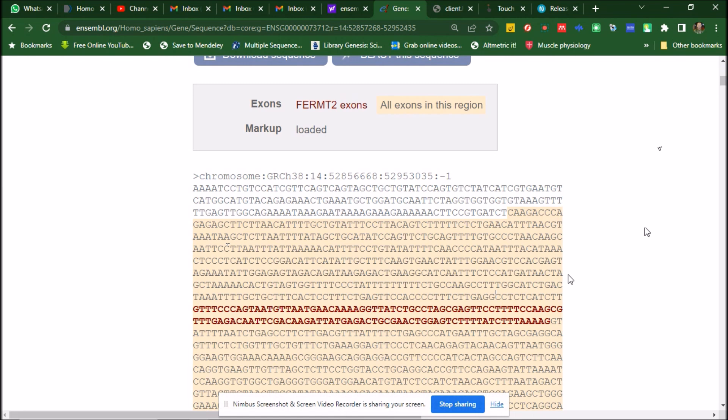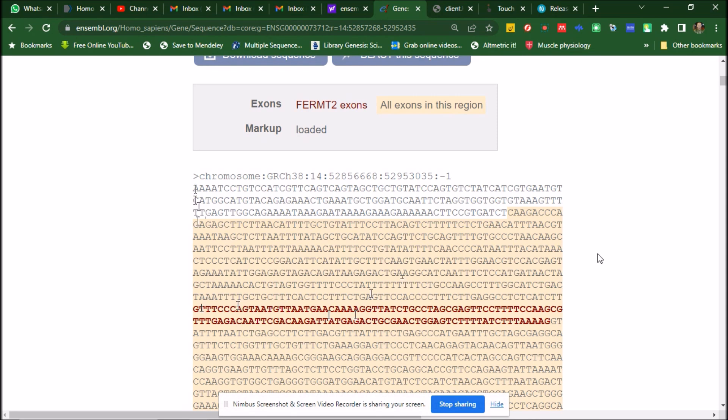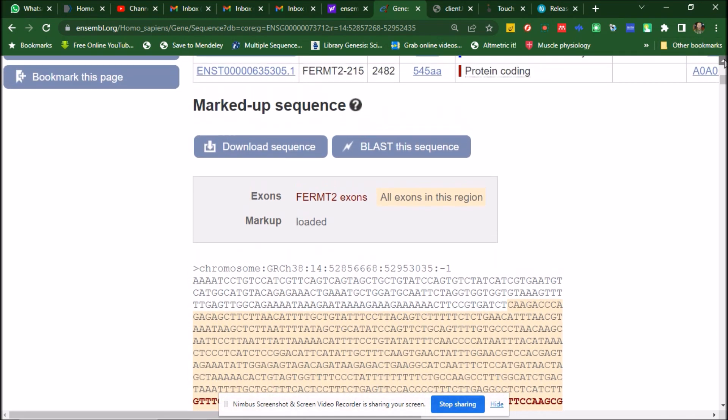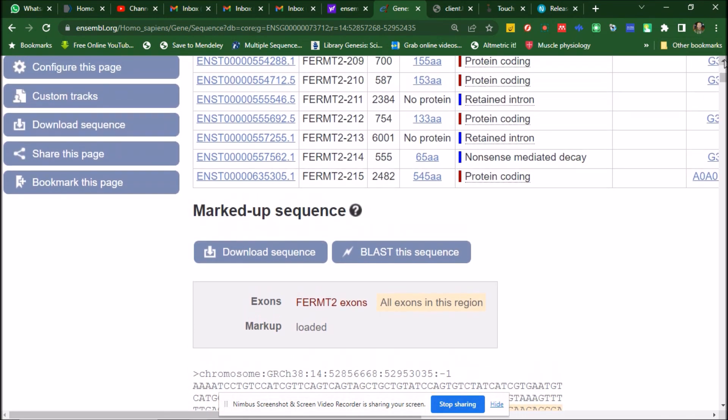Anyway, now this is the gene and upstream of this region is the promoter. So we now configure this page. So 5 prime flanking sequence.